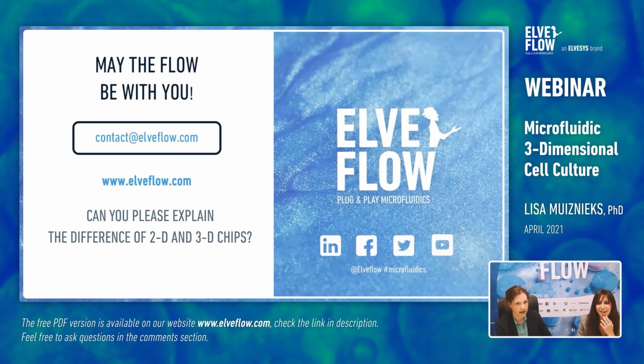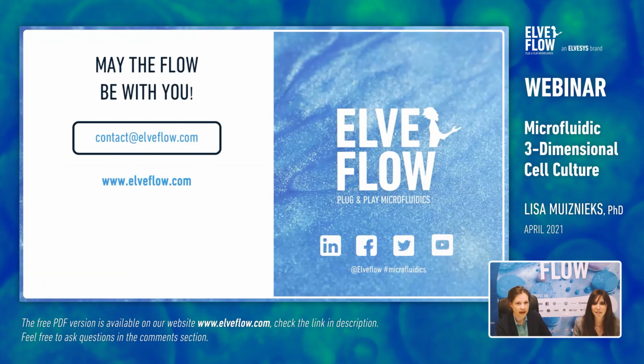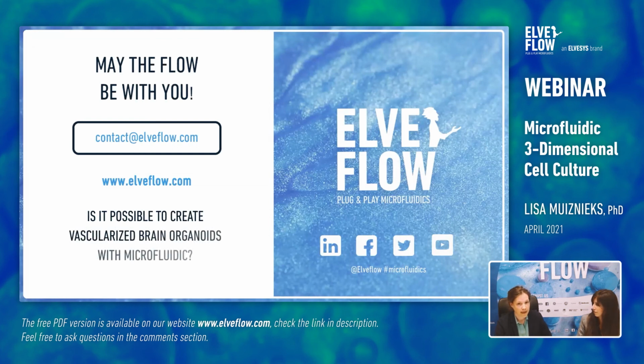Another question from Flora Magno. Thanks for the presentation. I'm new in this field and it was very clarifying. Thanks a lot. So is it possible to create vascularized brain organoids with microfluidics?